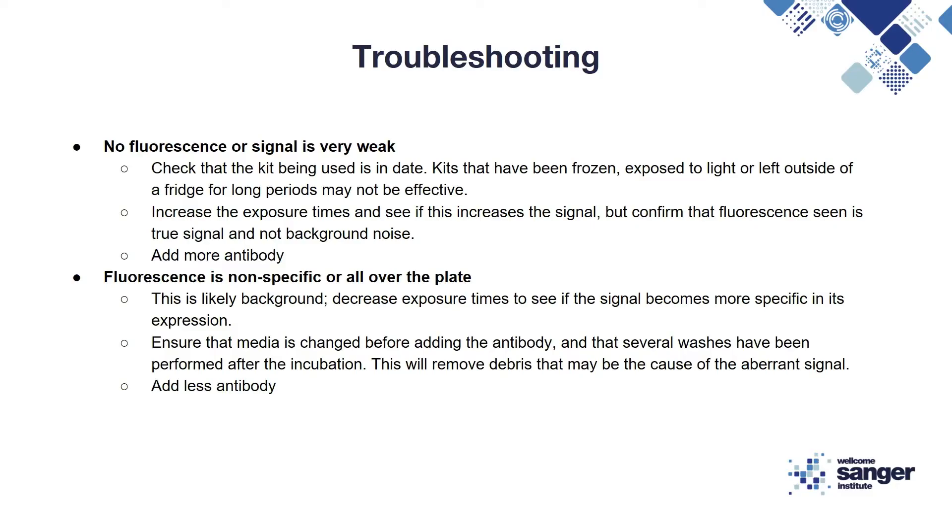If you are finding that there is no fluorescence or a very weak signal, firstly check that the kit that you're using is in date. Kits that have been frozen, exposed to light, or left outside of the fridge for a long time may not be effective. You can then try increasing the exposure time and see if this increases the signal, but make sure to confirm that the fluorescence you see is true signal and not background signal. You can then try increasing the concentration of antibody.